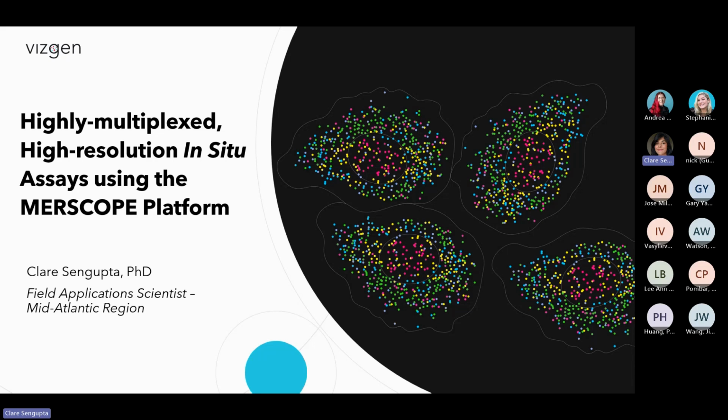And today we're going to be discussing highly multiplexed, high-resolution in situ assays using the Merscope platform.